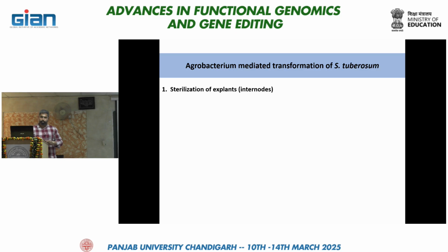So the first step is sterilization of the plant. As it freezes, I don't know, we have to wait. But in sterilization, what?